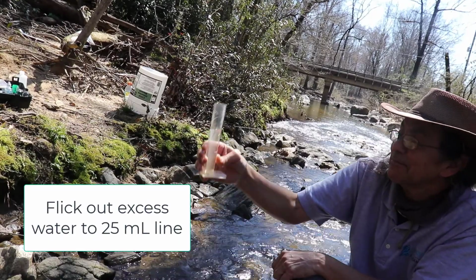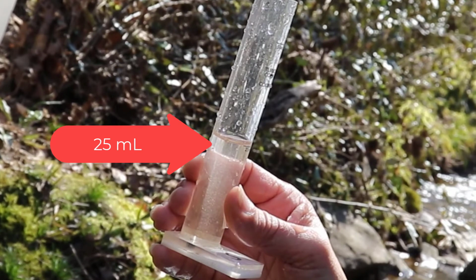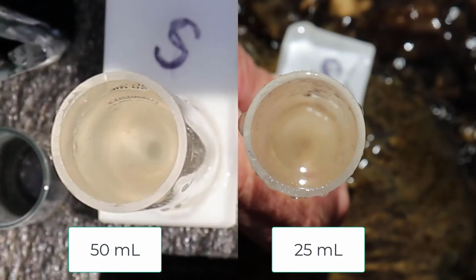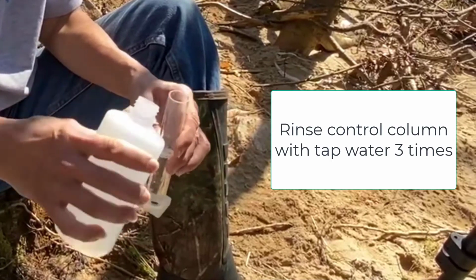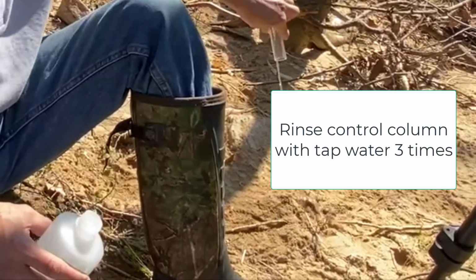Flick out excess water until the bottom of the meniscus is at the 25 milliliter line with your water sample. Look down into the column to find if, with that sample volume, you can see the black dot on the bottom of the column. When successfully seeing the black dot on the S column, rinse 3 times your second column, the one labeled C for control or T for tap water.